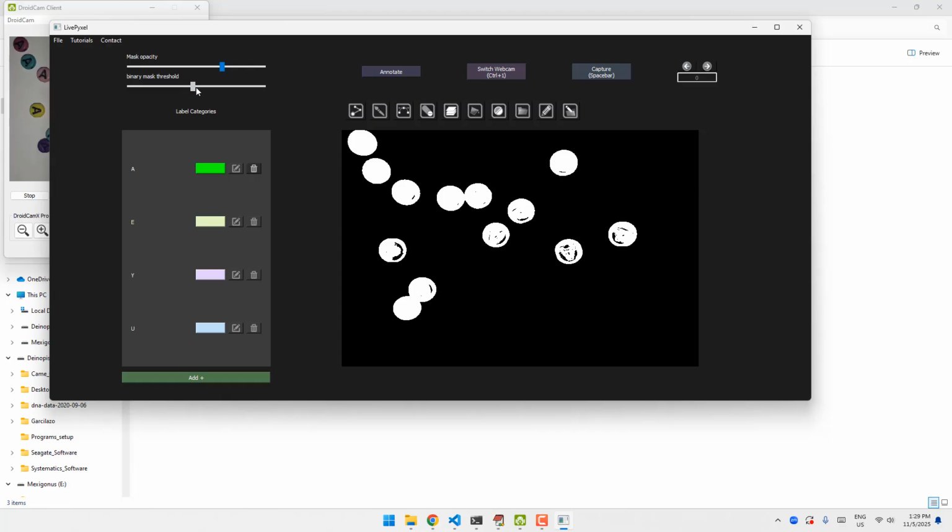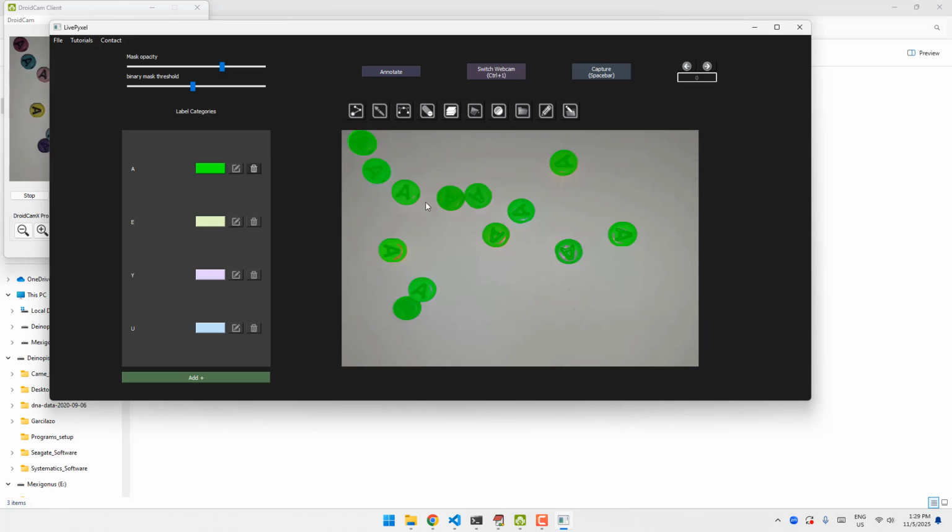And this is something that you only need to do once. Once the mask has been adjusted and the rest of your frames look very similar to each other, then you work under the assumption that those are parameters you don't need to modify anymore.